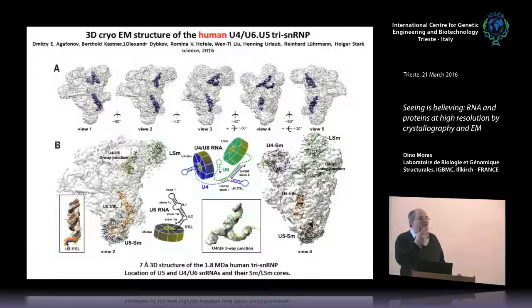The third, I told you there were 3 papers. I should have said 4, because the yeast has 3 papers. One by the Chinese group in Science, 2 in Nature that I just analyzed more deeply by the Cambridge group of Yoshinagai, and one at 6 angstroms, the other one 3.7. All 3 on yeast. Well, that's interesting, you can compare.